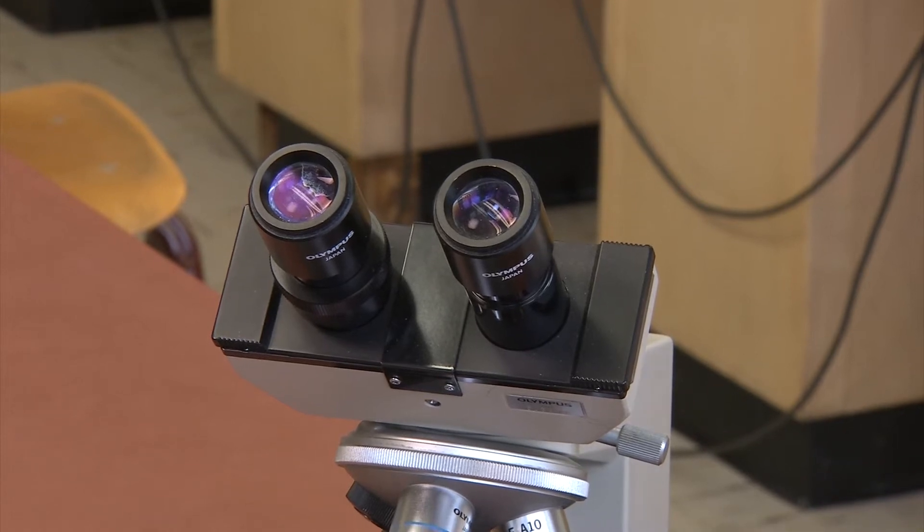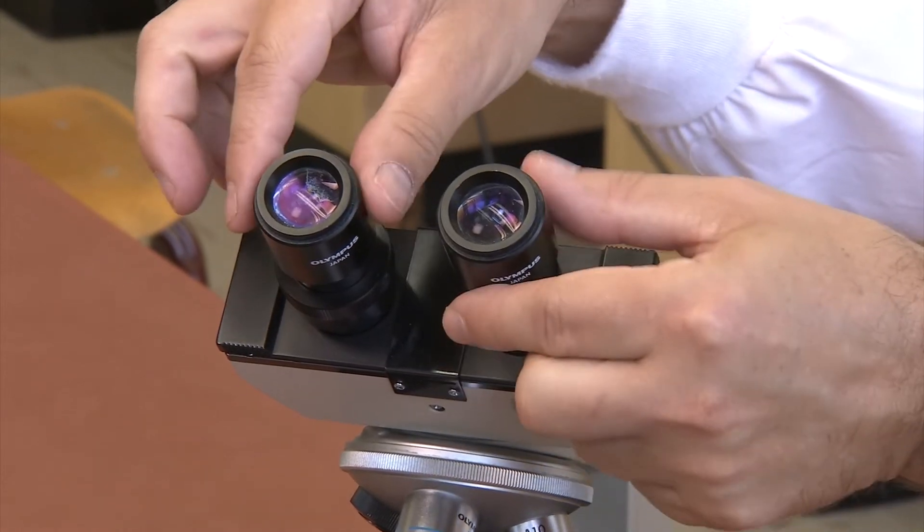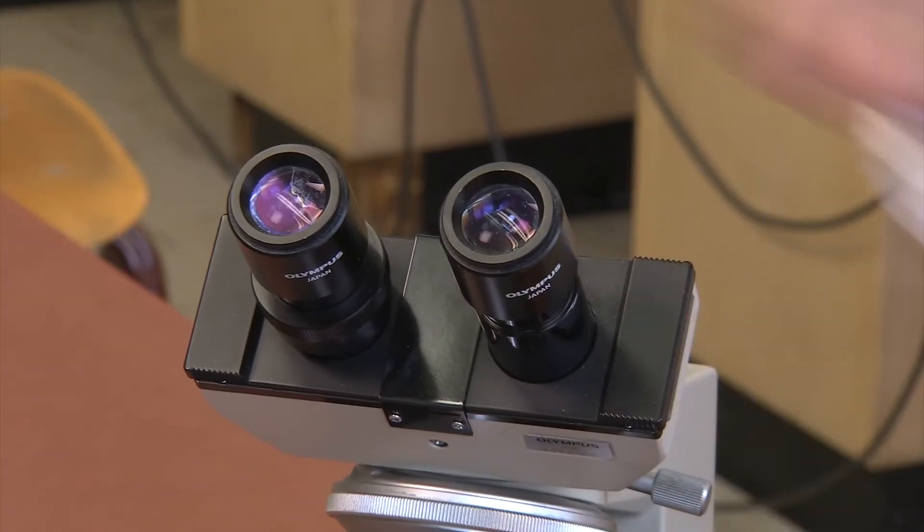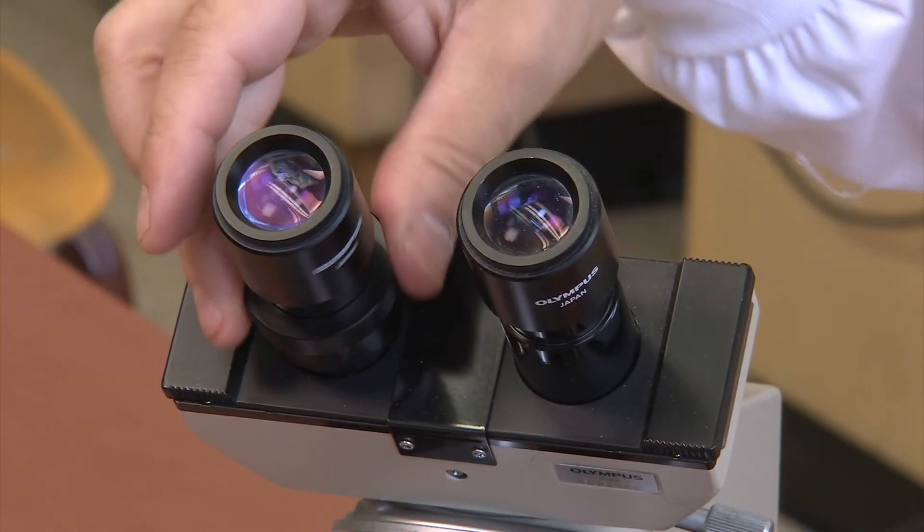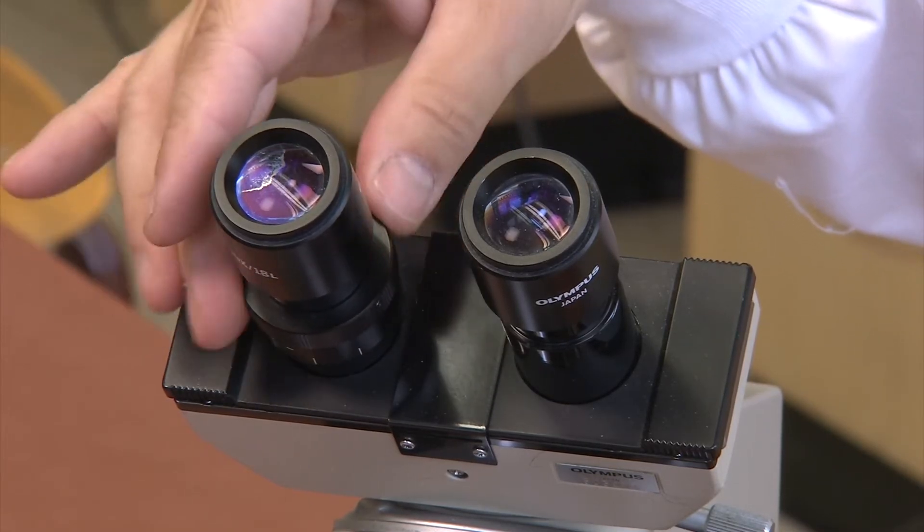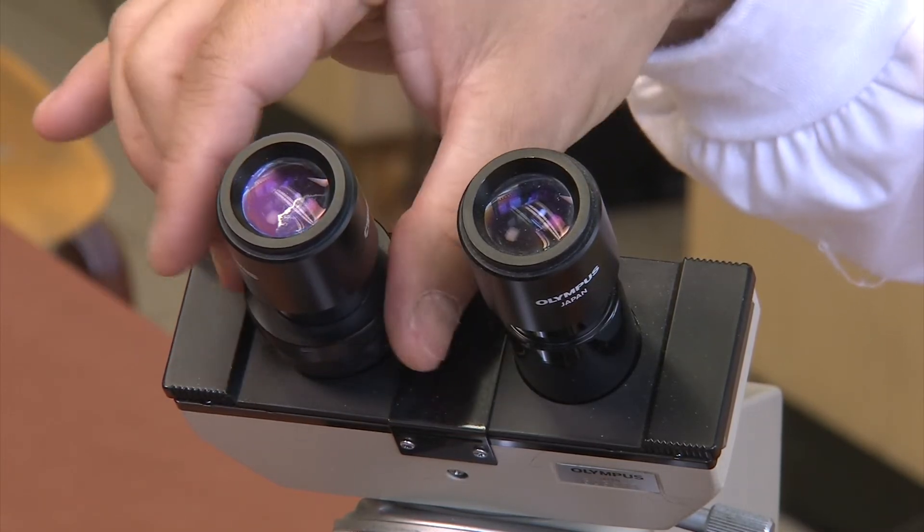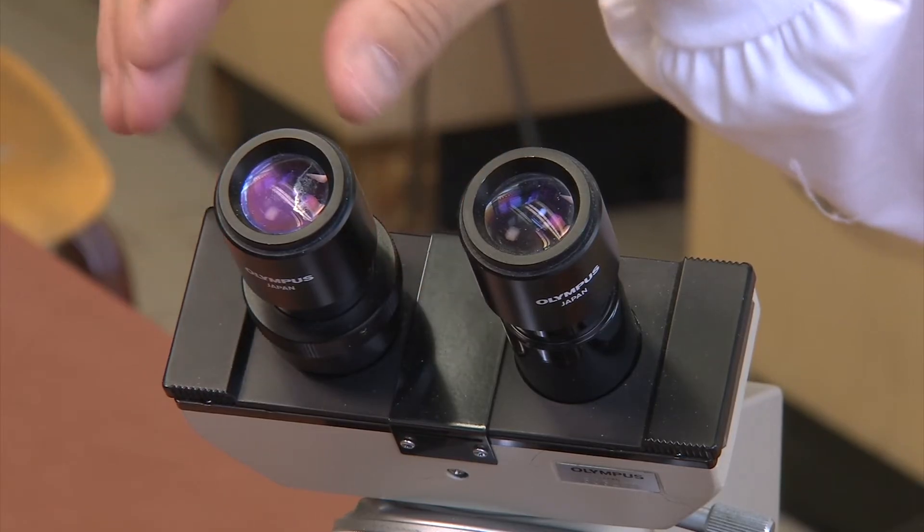Beginning at the top, we have the two ocular lenses, also called the eyepieces, which you look through to see your slide. The left ocular has an adjustment ring near its base. This ring is used to help compensate for the differences in vision between your eyes.